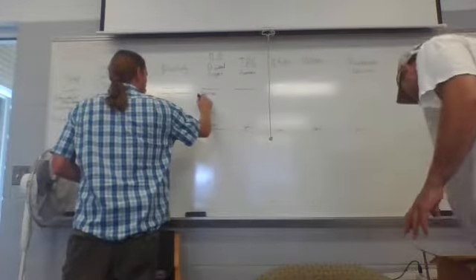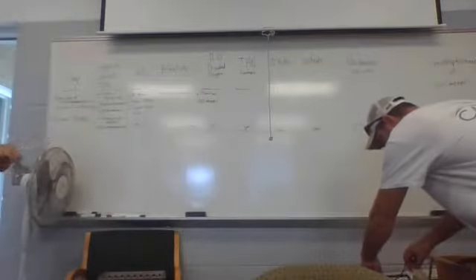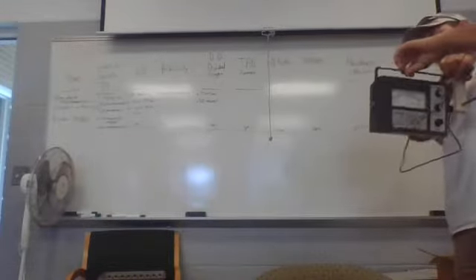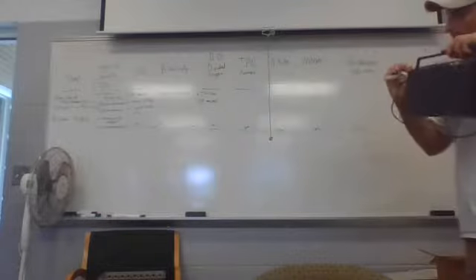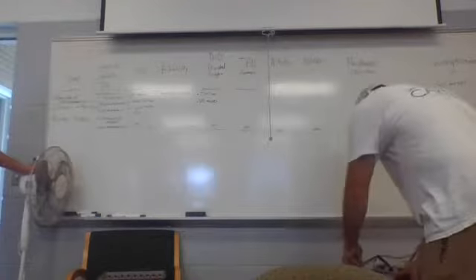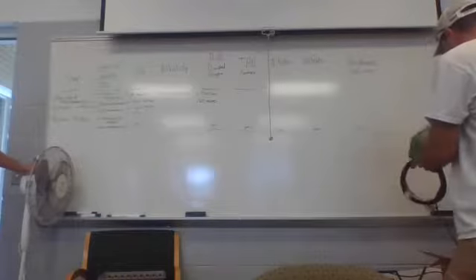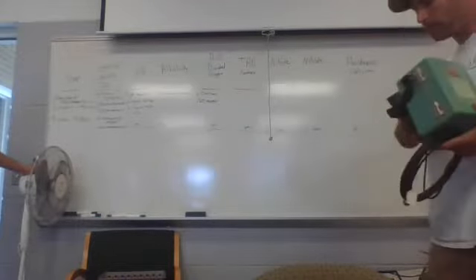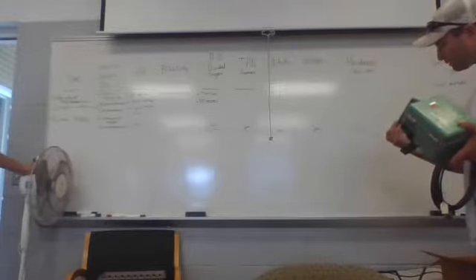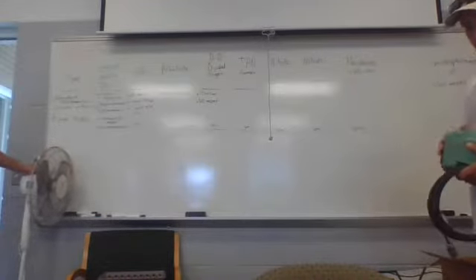We'll start with the old school. Oh, I forgot to show you my old school pH meter. It has a little digital scale and kind of looks like a radio, but it still has the same kind of probe that you would use today. I really don't know enough about this to tell you how it worked. That's a DO meter? Dissolved oxygen and temperature monitoring field unit.